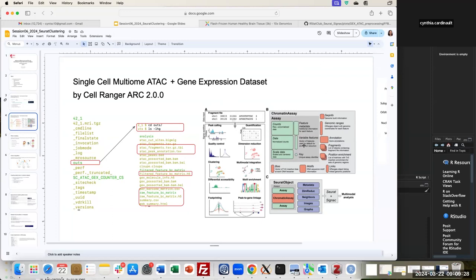Today we are going to continue with clustering. The Seurat object handles chromatin accessibility as an extension incorporated into the object. The first thing we did was create the Seurat object with gene expression information and then extend and attach the chromatin information. Now we are going to look at dimensionality reduction, nearest neighbors, and clustering for each one of the modalities — as part of an integrated pipeline to perform multimodal analysis.